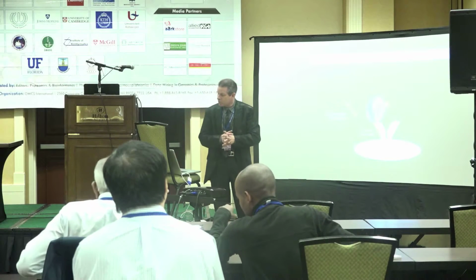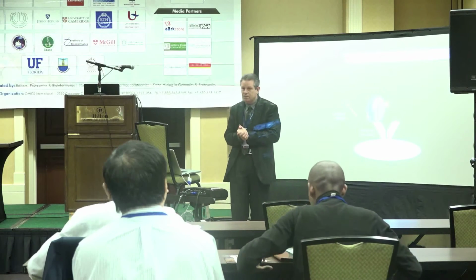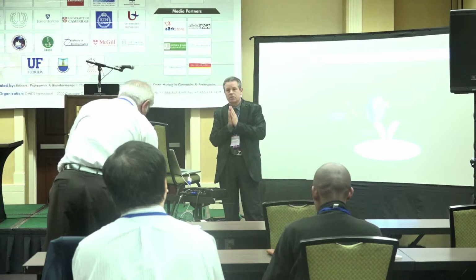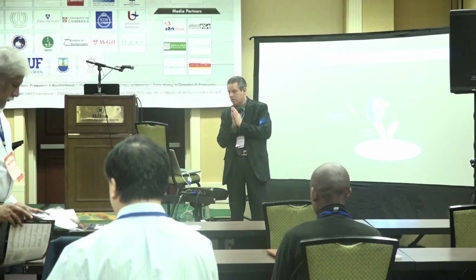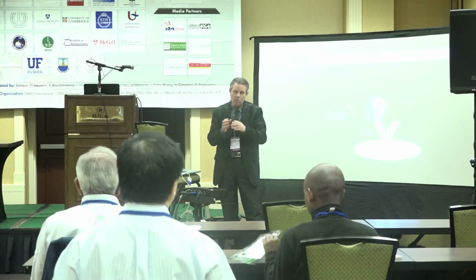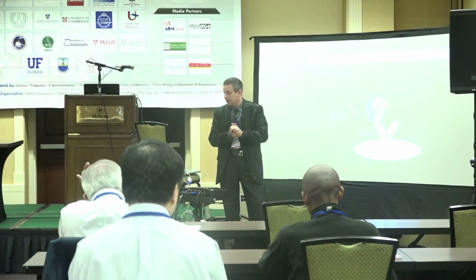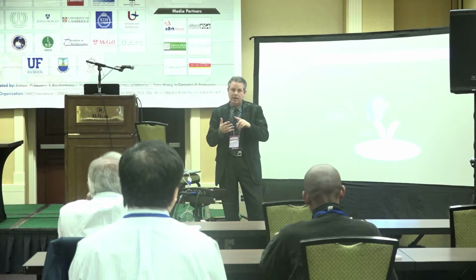Now, we have another approach to quantify phosphorylation. I told you that with the PY antibody in the sandwich assay, you look at tyrosine phosphorylation. But another approach is to use a dye called P-Imago, which is developed by a company called Tymora, in Indiana at Purdue University. We've been working with them over the last year and a half to optimize the system for detection with microarrays. And the Tymora reagent binds serine, threonine, and tyrosine.